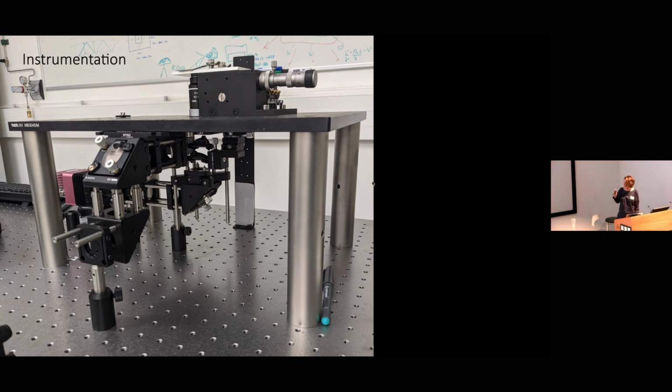And the fluidics is imaged by a dark field microscope that might not look like a traditional optical microscope. We built our own, and not only because we like to play with components. We are physicists, of course, we love to play with the components.